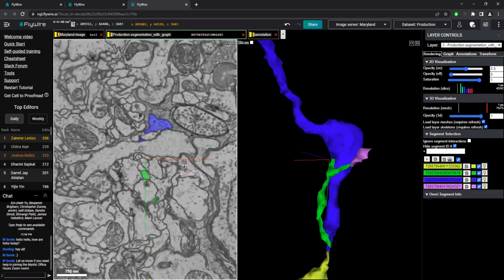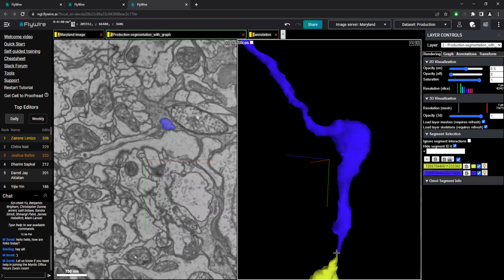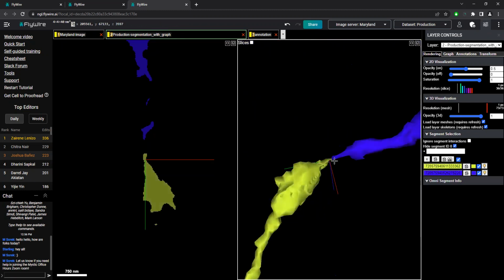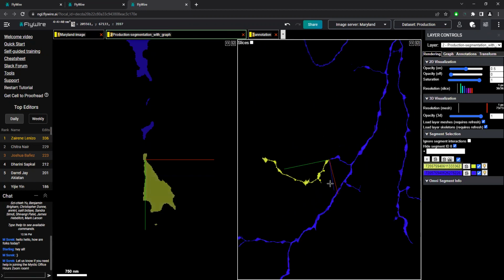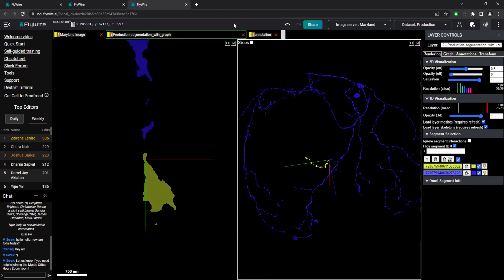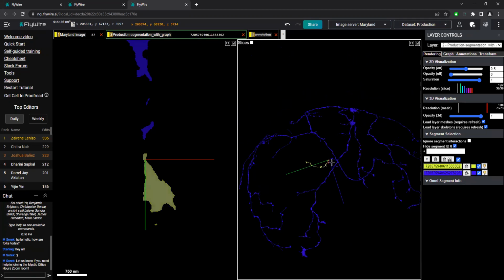And this seems to end here. So this isn't feeling quite right, this blue piece. I mean, this green piece. So I'm going to keep this blue piece right here. And just by a process of elimination, I'm going to look out and see how that goes. I'm going to just turn off your annotation layer real quick here. And that looks pretty good.